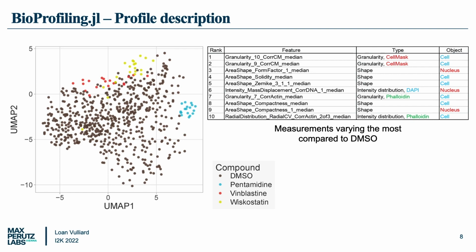And here, let's not worry about the details. I just wanted to point out that we have measurements linked both to the cytoplasm and to the nucleus, and to all three channels that we imaged that were relevant. So really all aspects that we investigated in this experiment were compiled and useful in the profiles that we curated.